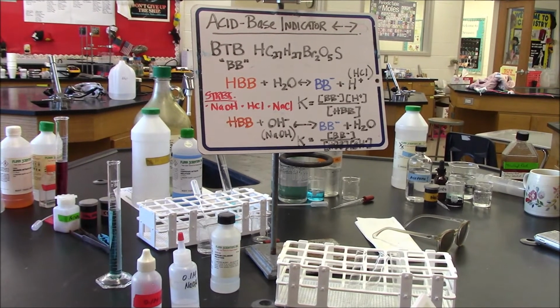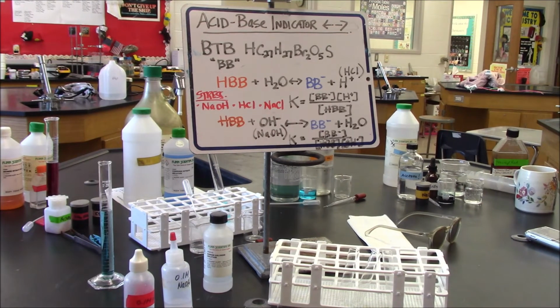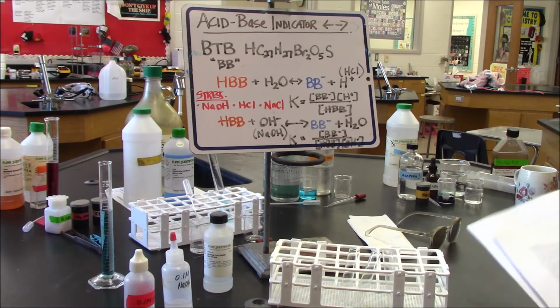Hi guys. Today what we're going to be doing is completing Investigation 13, and really what Investigation 13 does is put Le Chatelier's principle into action. We're going to be looking at 6 different systems at equilibrium and applying different stresses to see how the equilibrium responds as a result of those stresses.